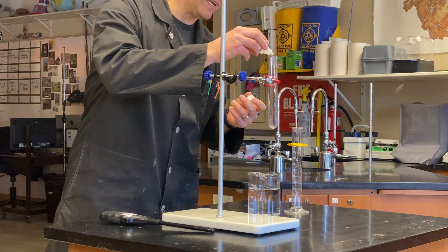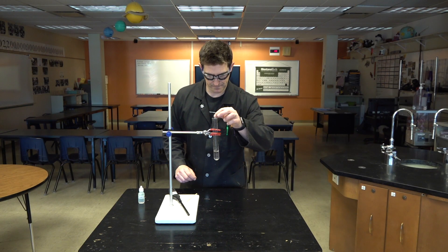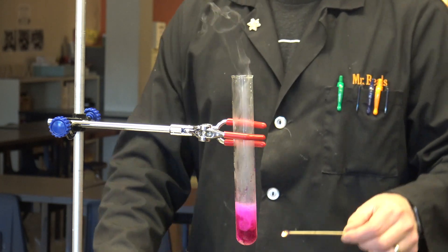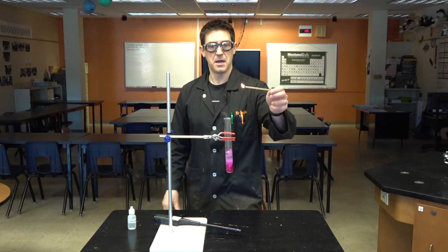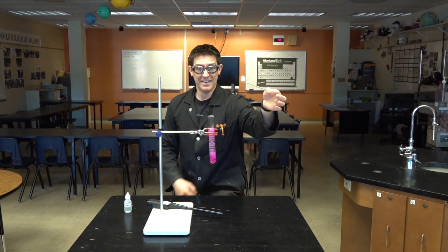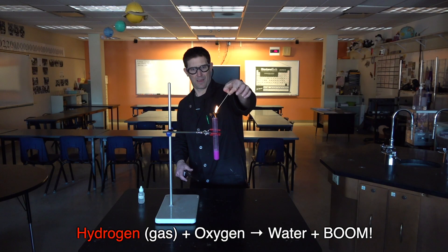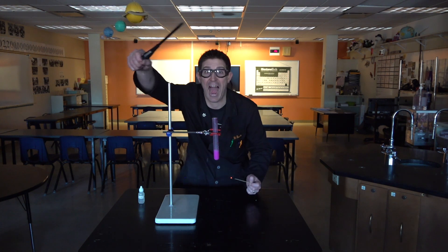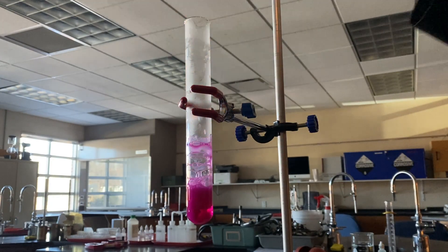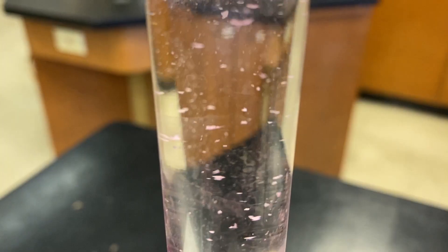This time I'll add the phenolphthalein indicator ahead of time. Let's turn the lights off. If this is the Fire and Ice experiment, well, there's our fire. Where's our ice?